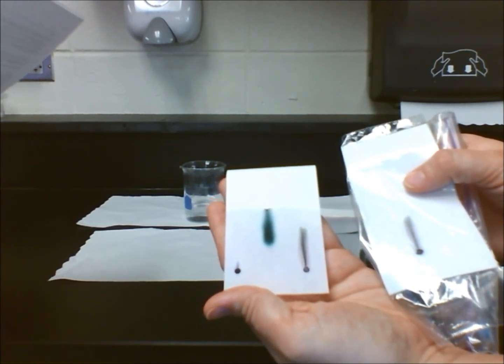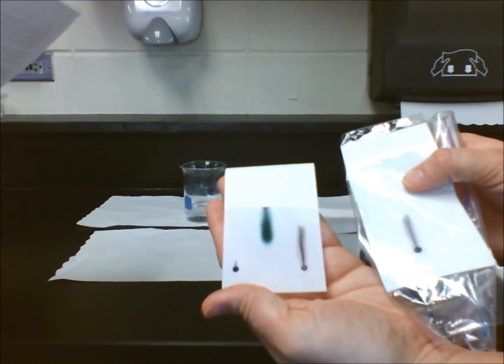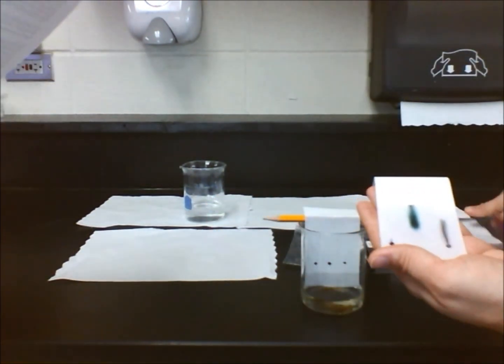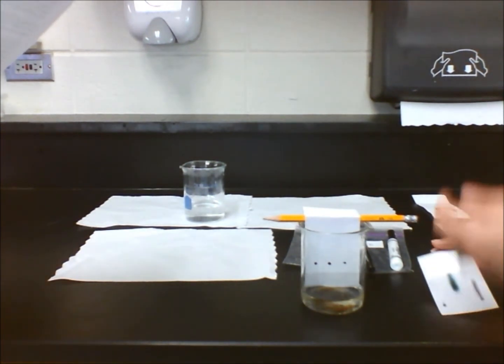Chromatography is a process used to separate different solutes from a solution by passing them through a piece of chromatography paper. It's a technique used to solve specific problems and crimes.